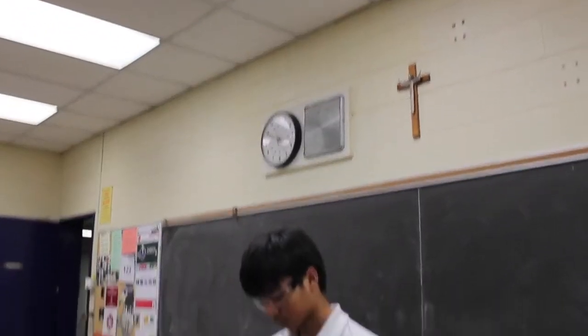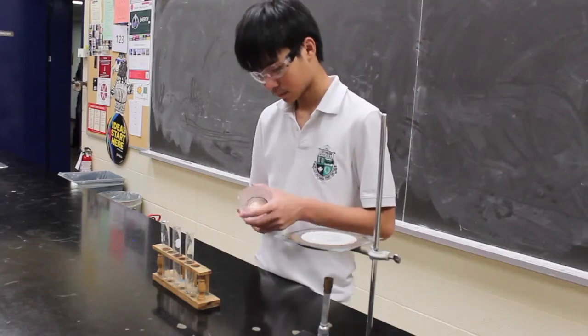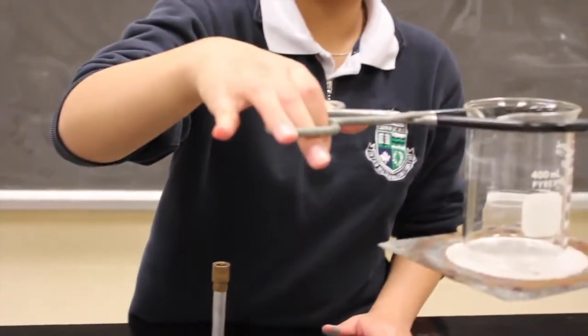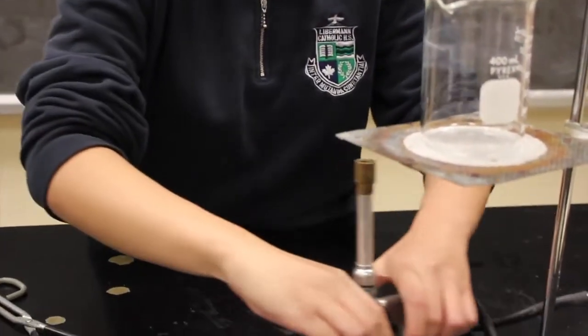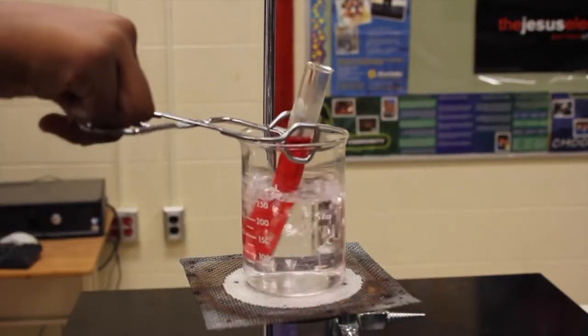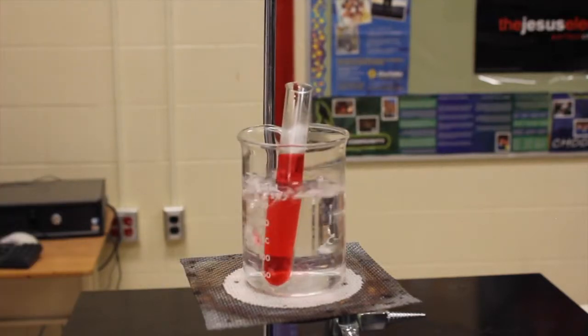Before heating glassware, check for any cracks or stars, which are dangerous because they can actually break. Containers with a flat bottom are usually placed on a wire screen on a ring stand. If you need to heat up volatile chemicals, never use a Bunsen burner, as this could cause flammable vapors. To heat up a test tube, place it into a beaker with boiling water. This allows the test tube to heat up evenly and prevents it from boiling over.